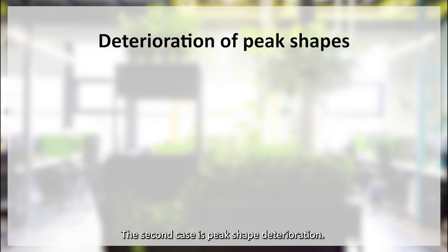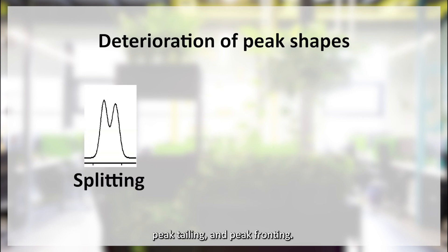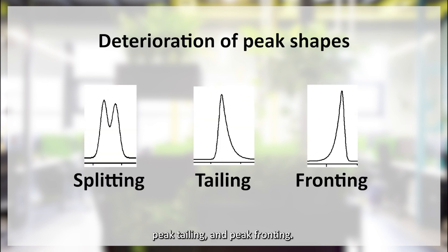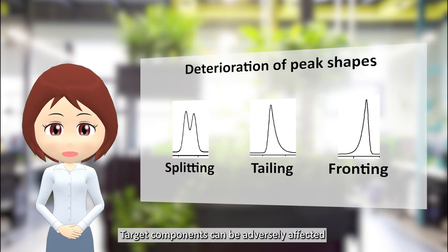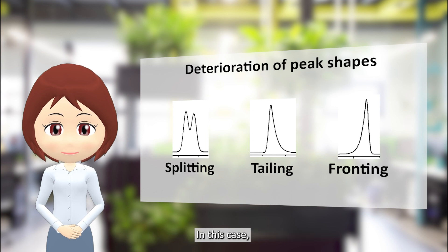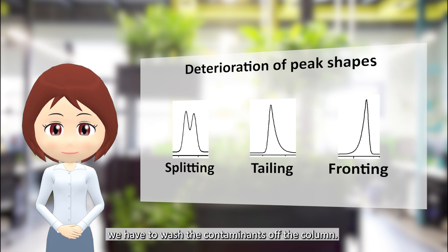The second case is peak shape deterioration. Examples include peak splitting, peak tailing, and peak fronting. These can be caused by contaminants absorbed on the column, which can change the retention behavior. Target components can be adversely affected by contaminants absorbed on the column. In this case, we have to wash the contaminants off the column.